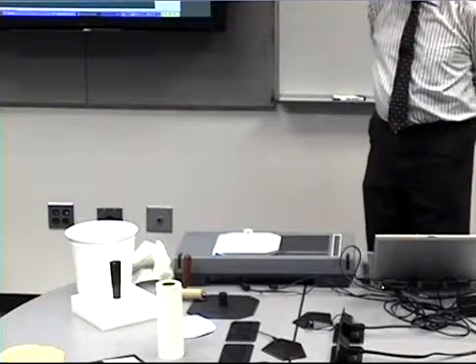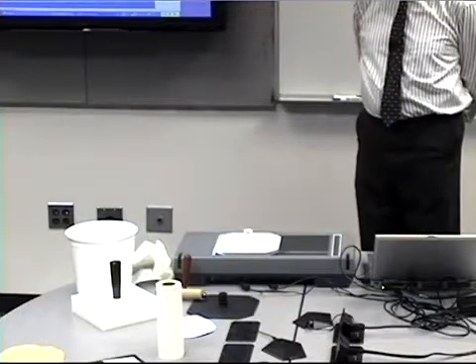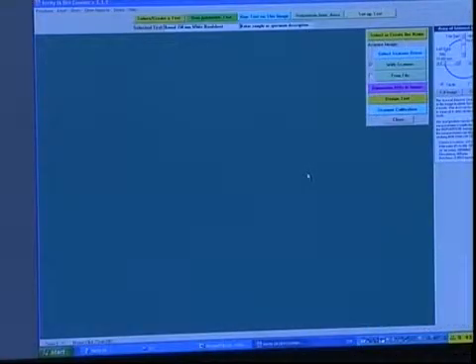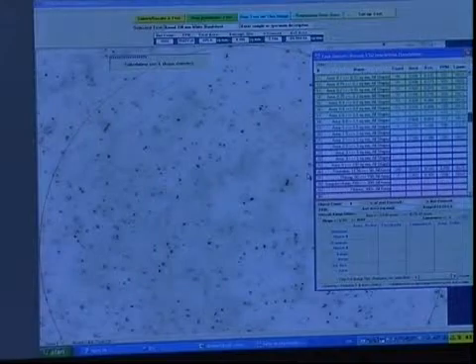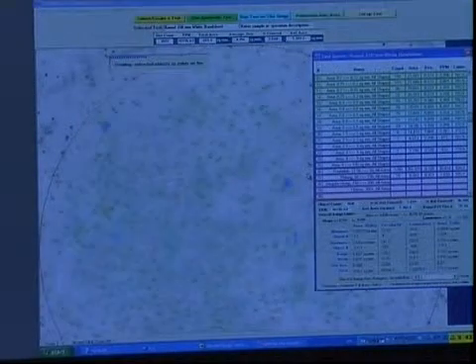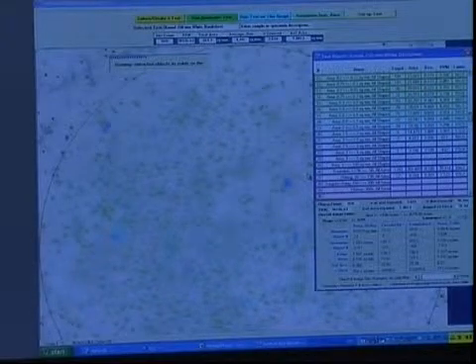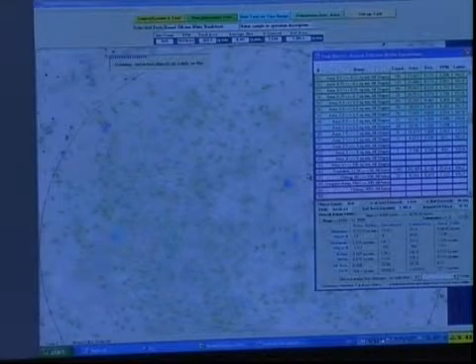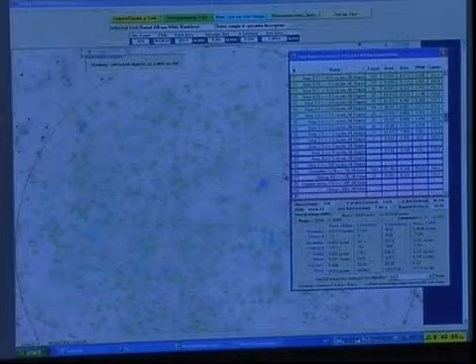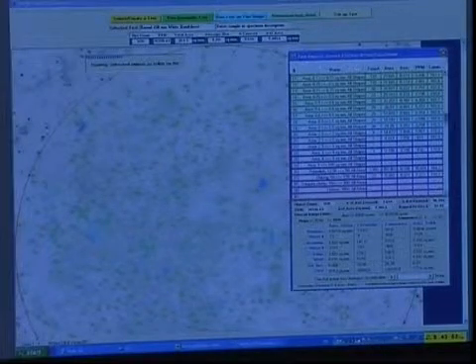The scan is complete. It should be loading in. And what is going on here? Here it goes. And you see the computation proceeding. It's counting away, and here we go. We have 1,415 specs. And the test is now complete. It is that simple.